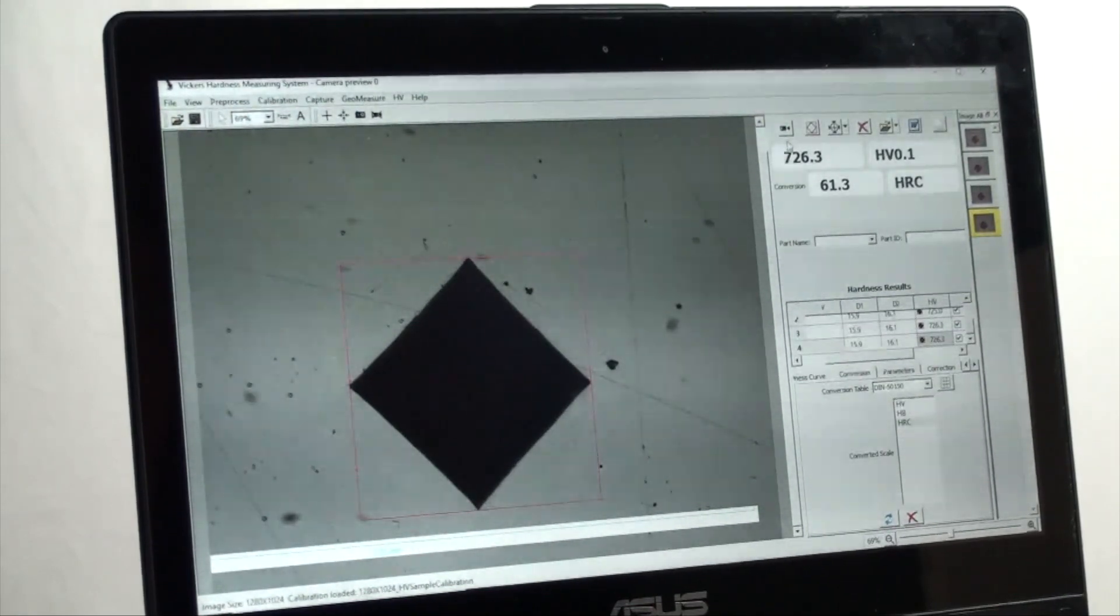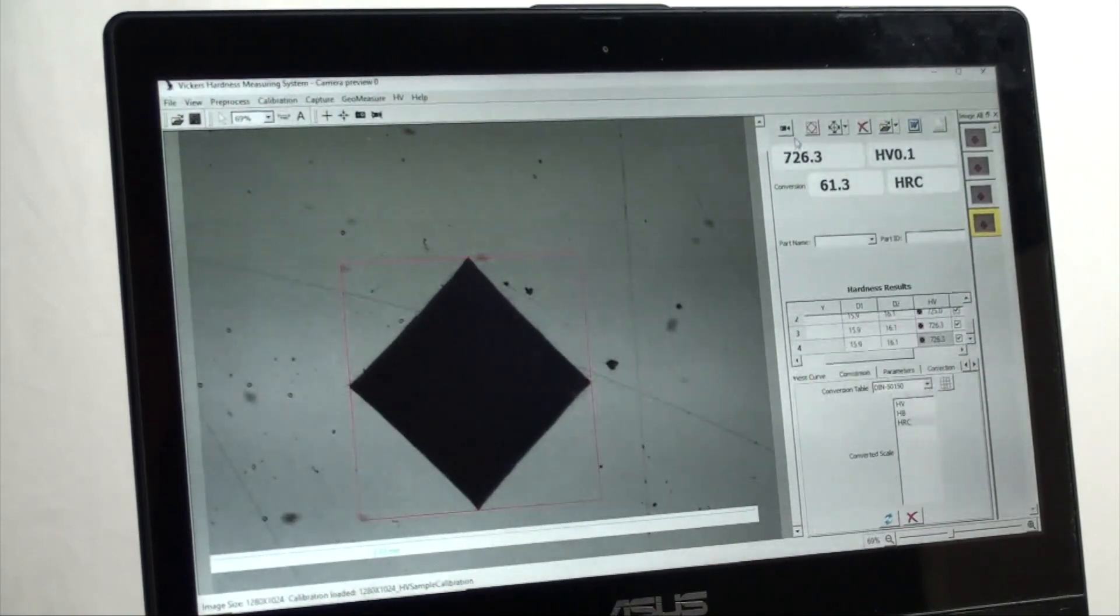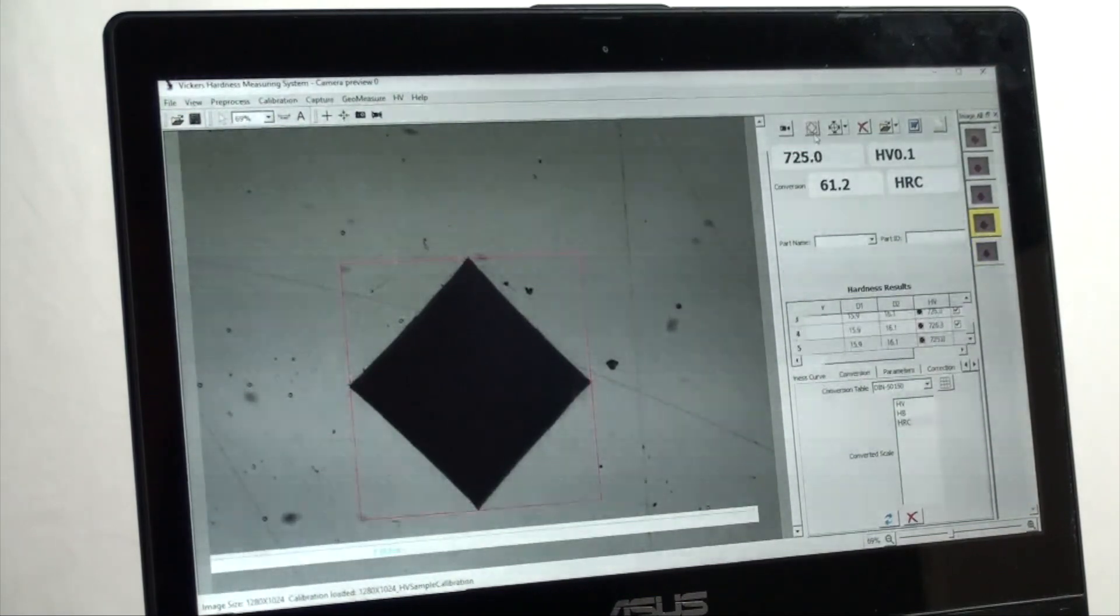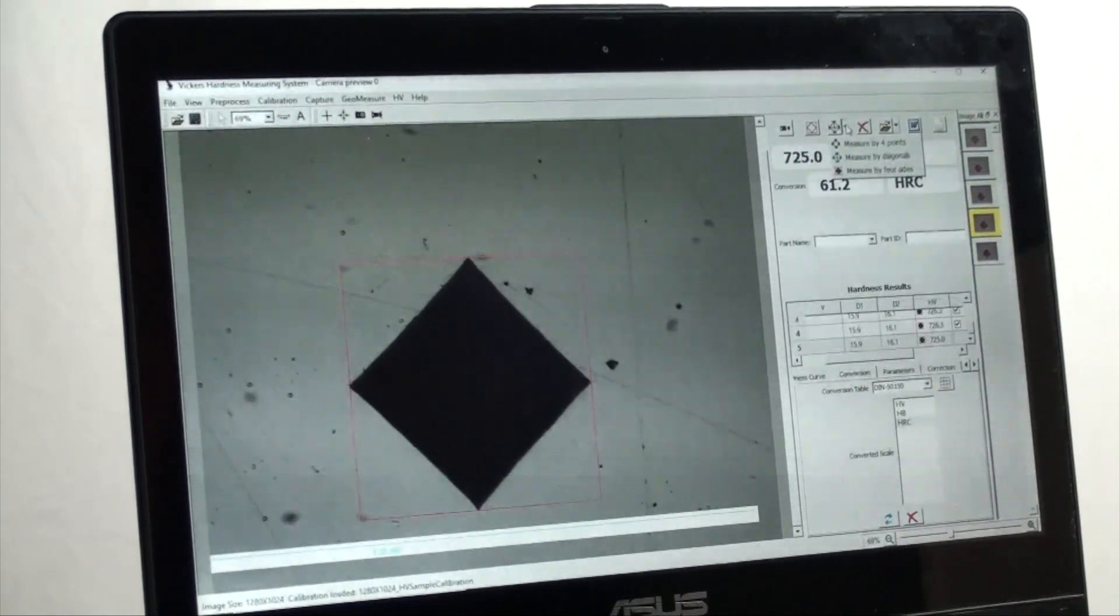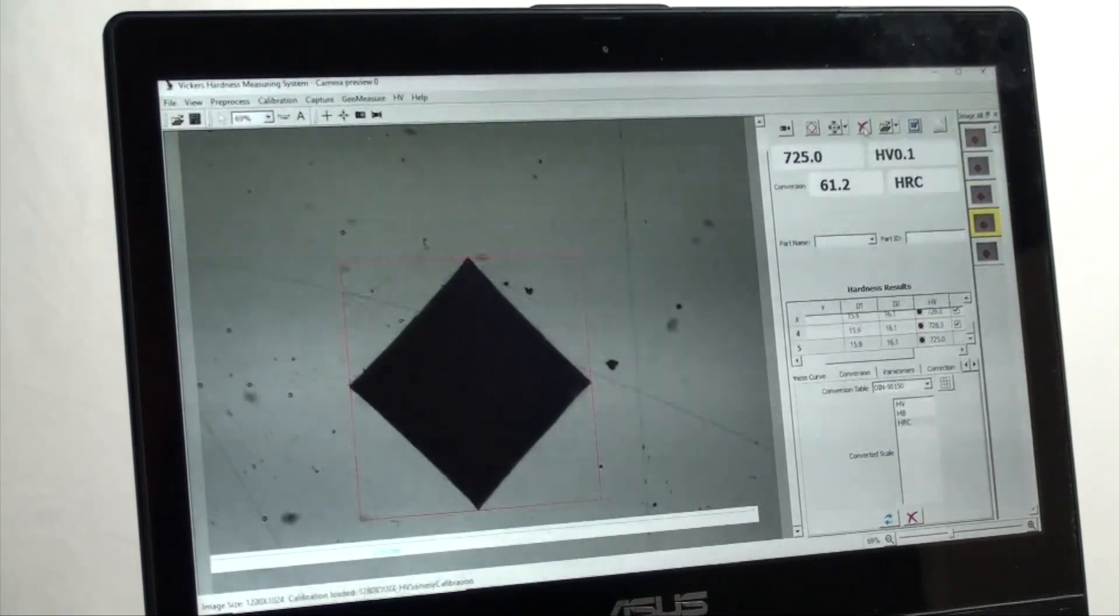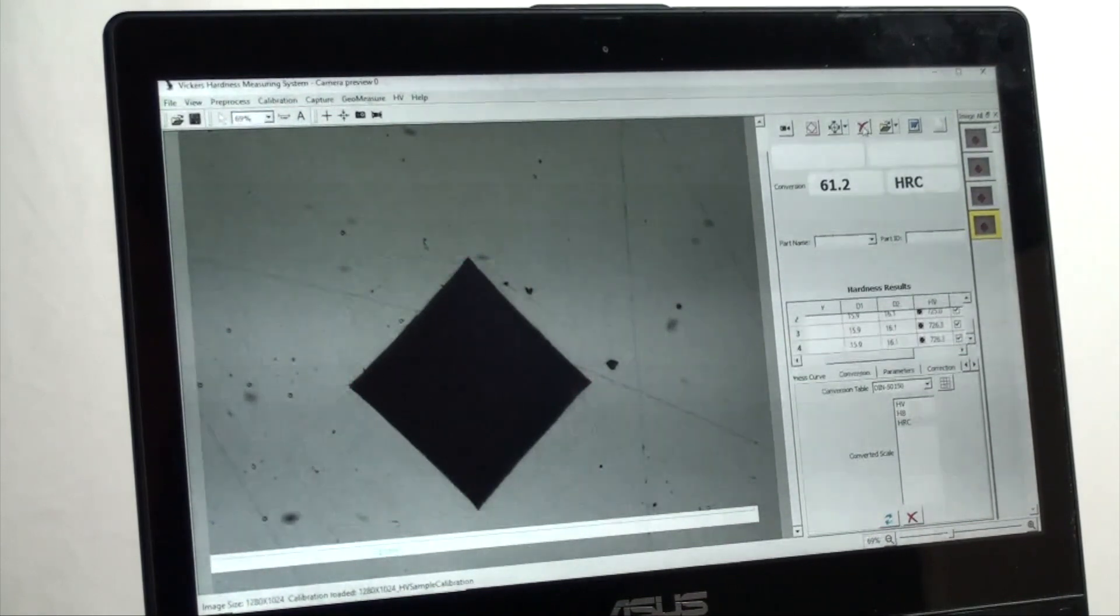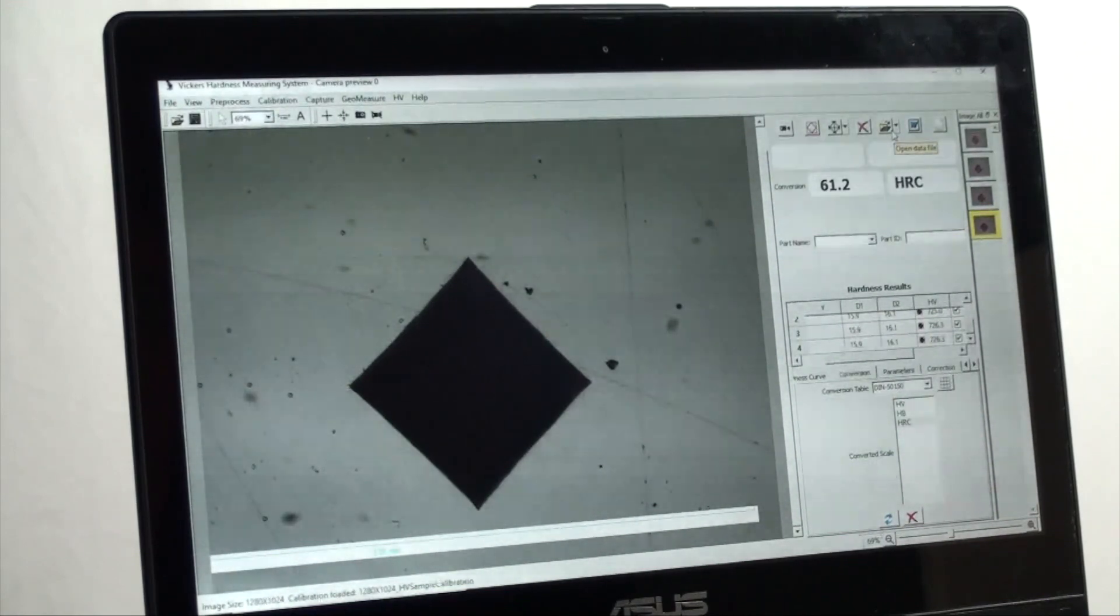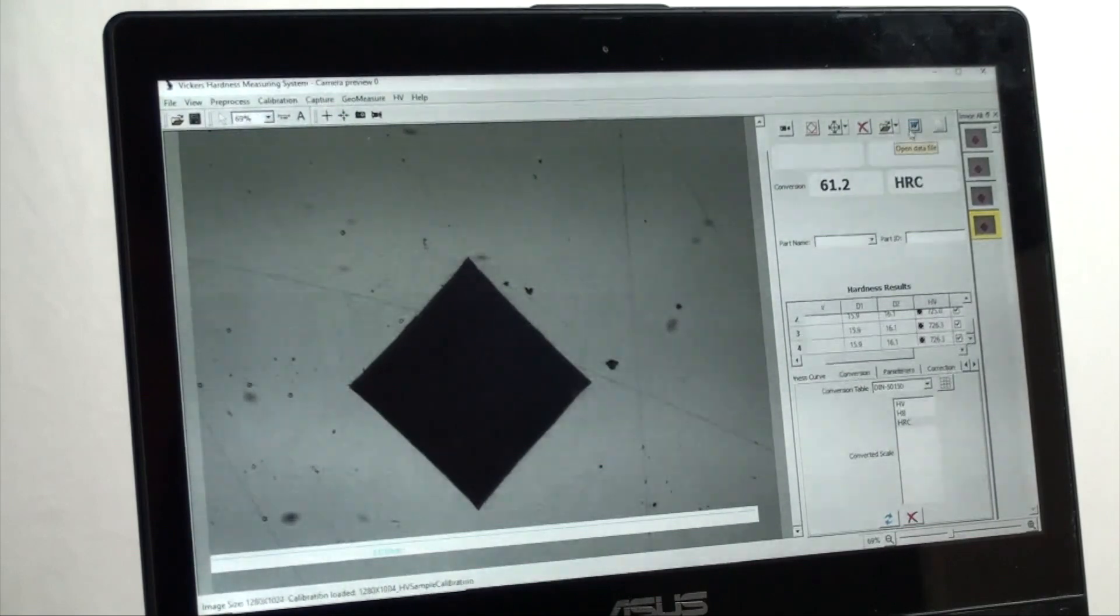On the top right we have refresh. Then we have auto measure. And then we have measure by diagonals or points for the A version software. Next is delete the previous measurement. Next is select data file locations. Next is to generate reports.